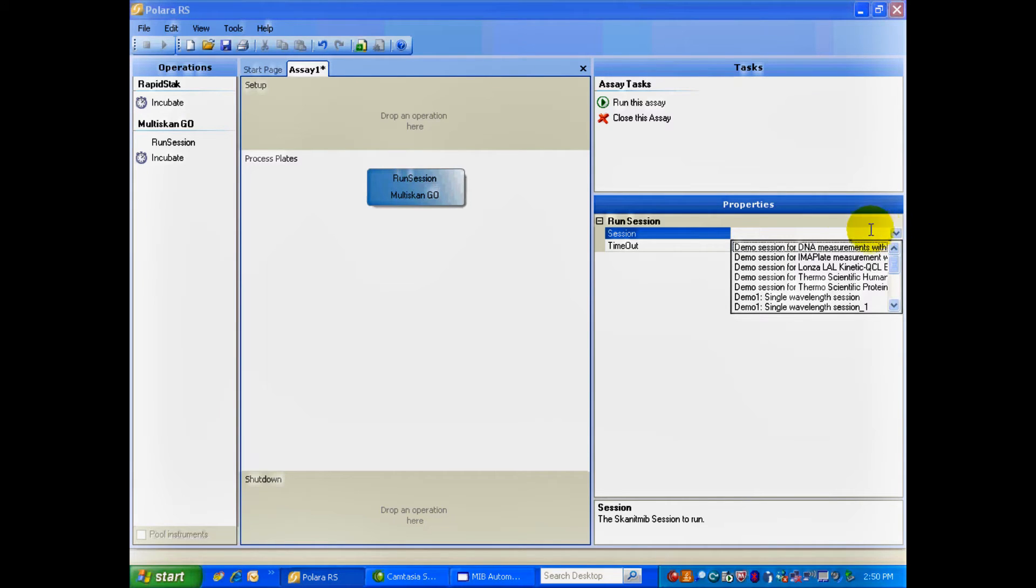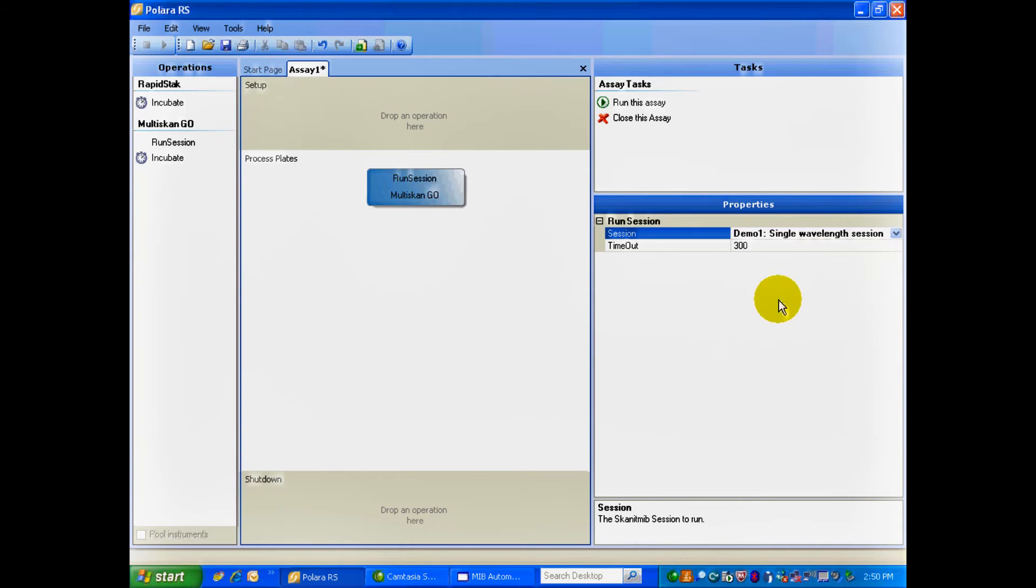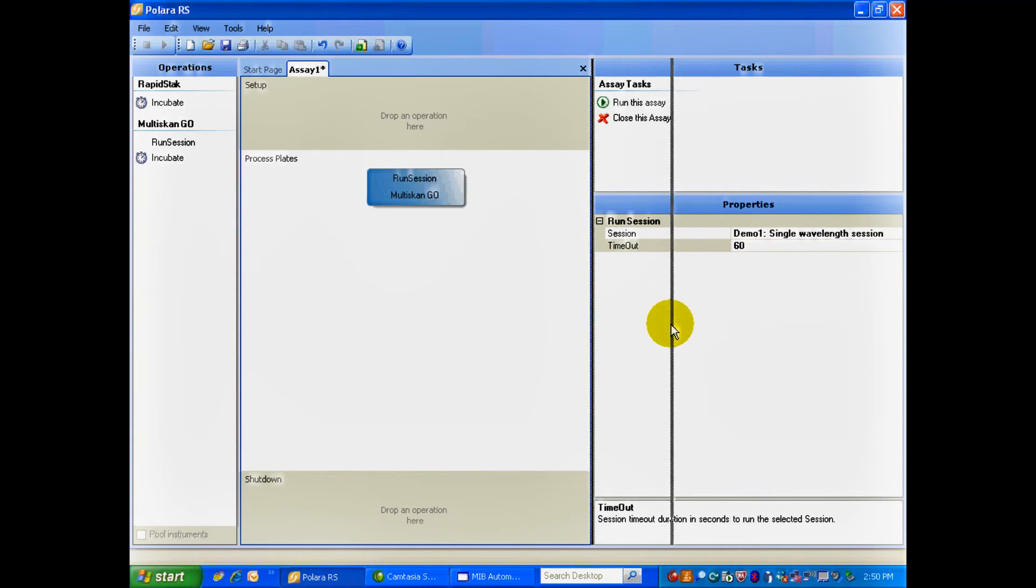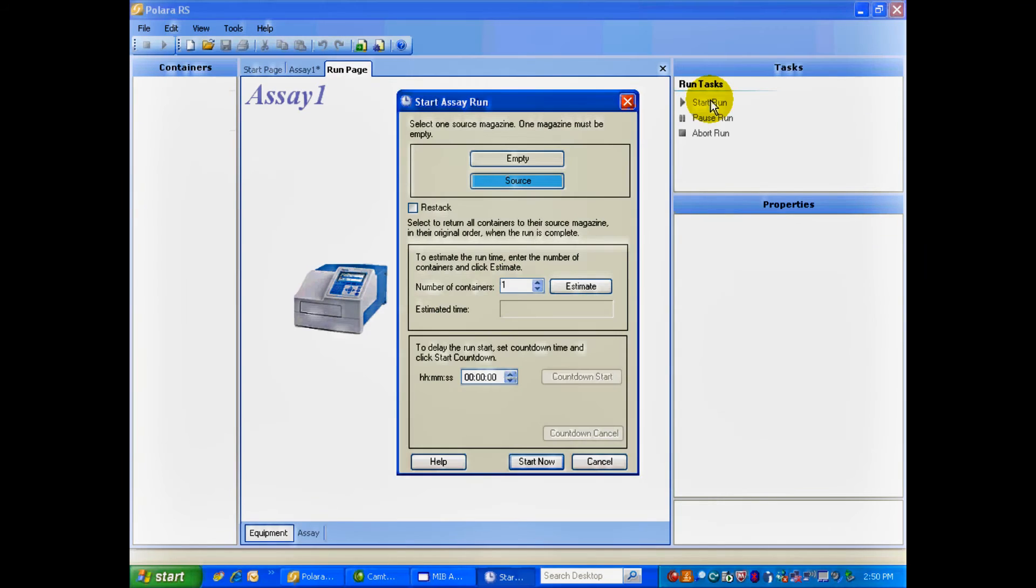And you can see, here we are, they've all come through. I'm going to select Demo 1. I'm going to give it a timeout of just 60 seconds. And next, all I have to do is select, in the Tasks, Run This Assay.